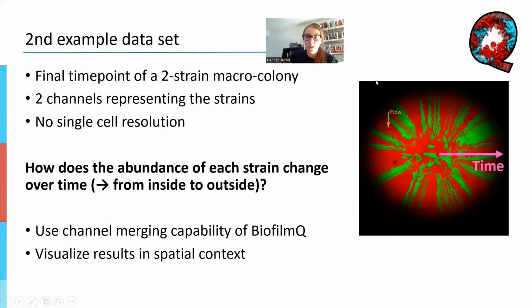So we will have these 2 data sets to look at in the practical part of the course, which is going to start right now. And I hope that you enjoy it.